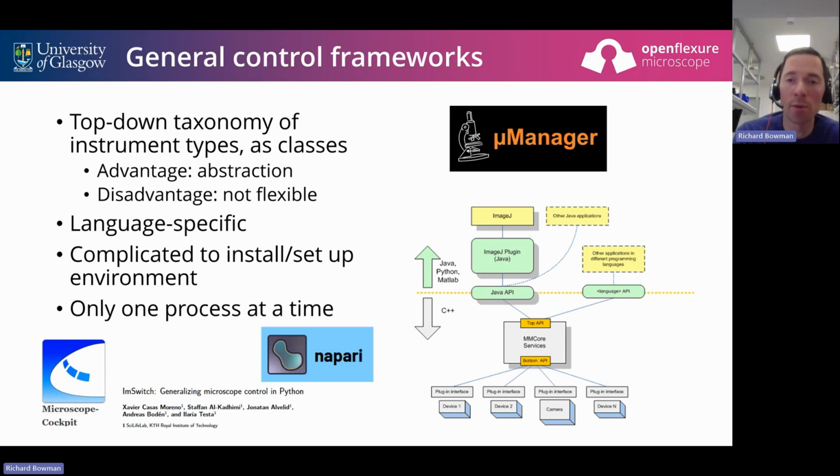And so if you come up with a camera or a stage that works in a slightly different way, it's very hard to crowbar that into the existing API. And of course, because most scientific software is written by scientists who have very little bandwidth for making good control frameworks, anything that tries to be universal is never quite as universal as it thinks.